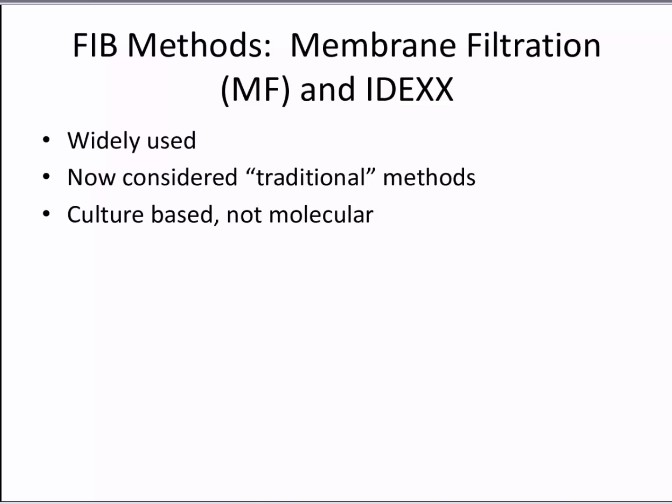All right, so there's two commonly used approaches for quantifying fecal indicator bacteria levels in water, and that is membrane filtration and IDEXX. And they're actually now considered traditional methods because they're culture-based and they're not molecular.